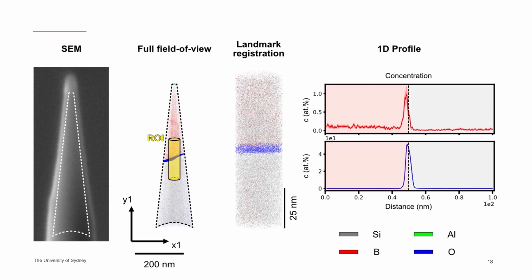Special attention had to be paid to the buried oxide layer and the dopant distribution in its proximity. And while we were successful in ensuring a smooth transition between the different layers, we had to restore the oxide morphology as close as possible to its original condition in the reconstruction.